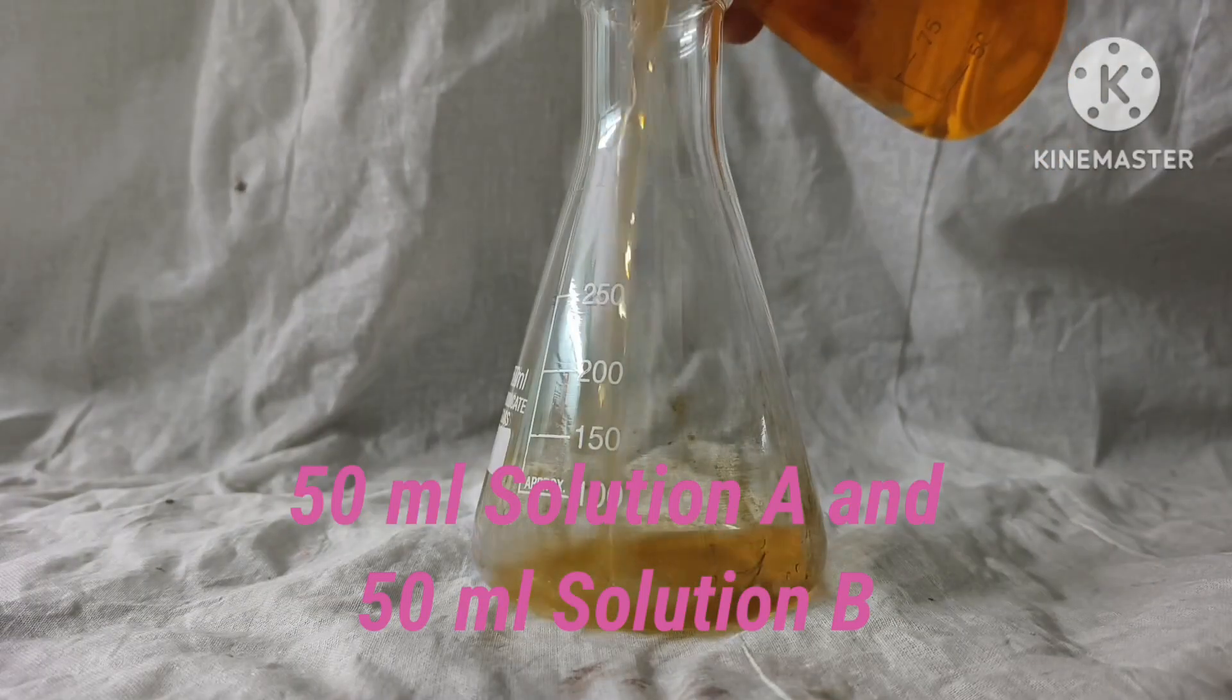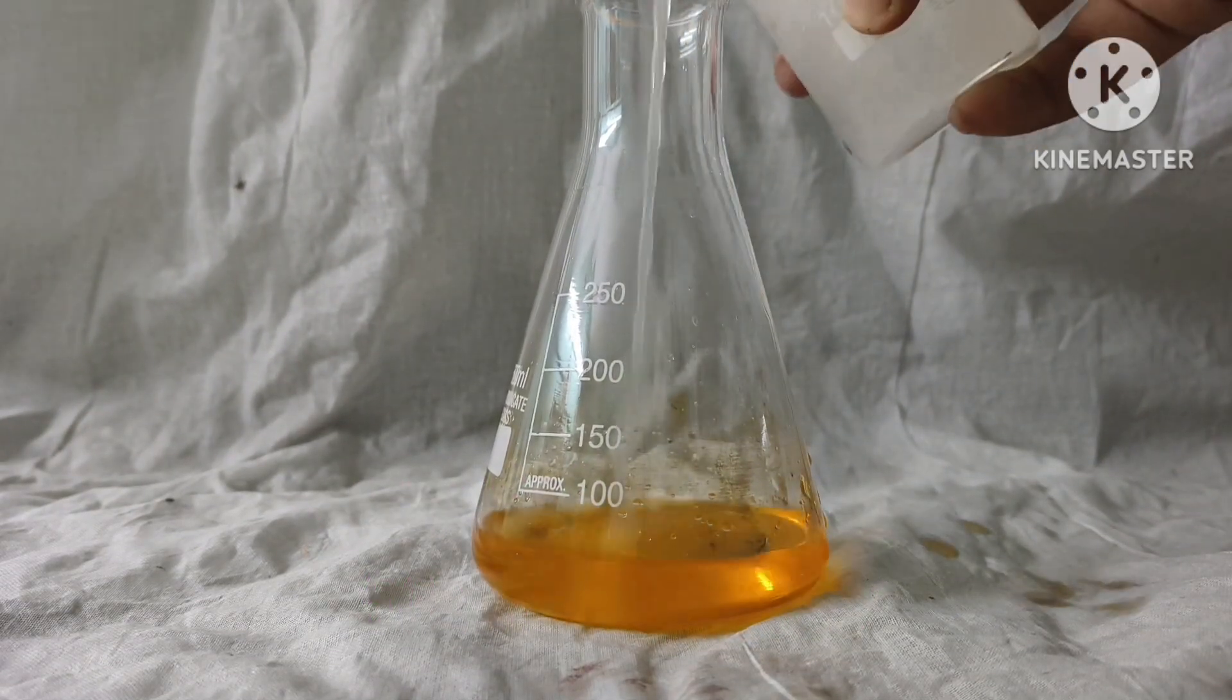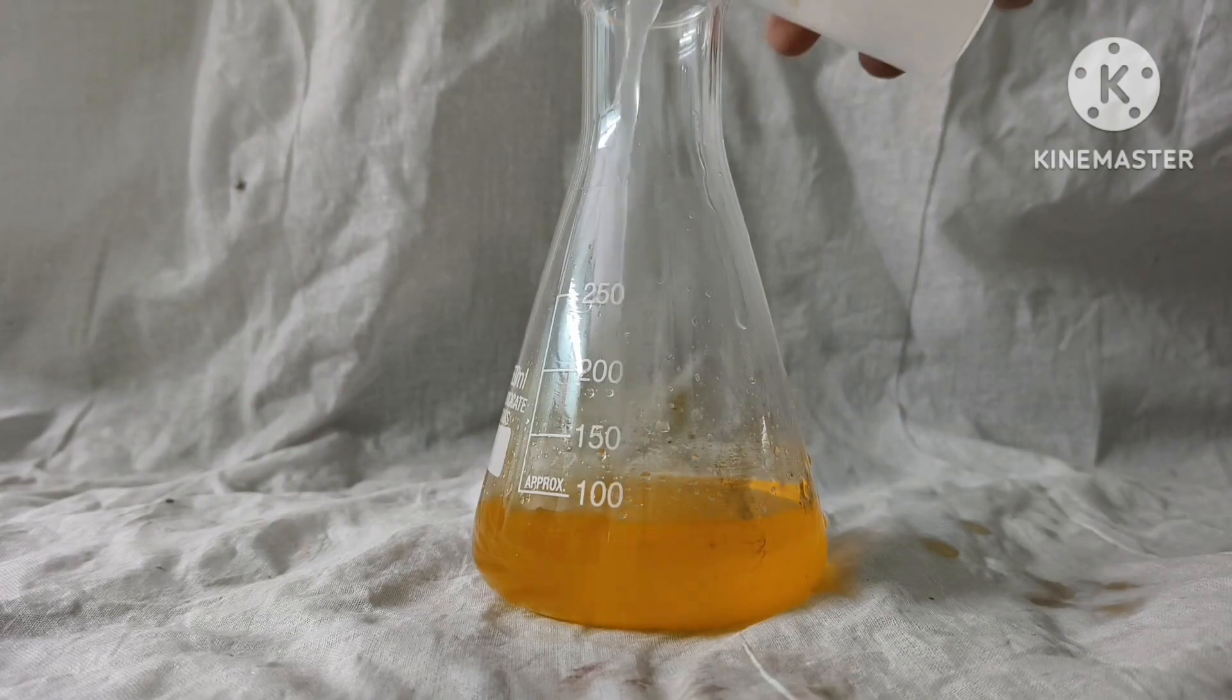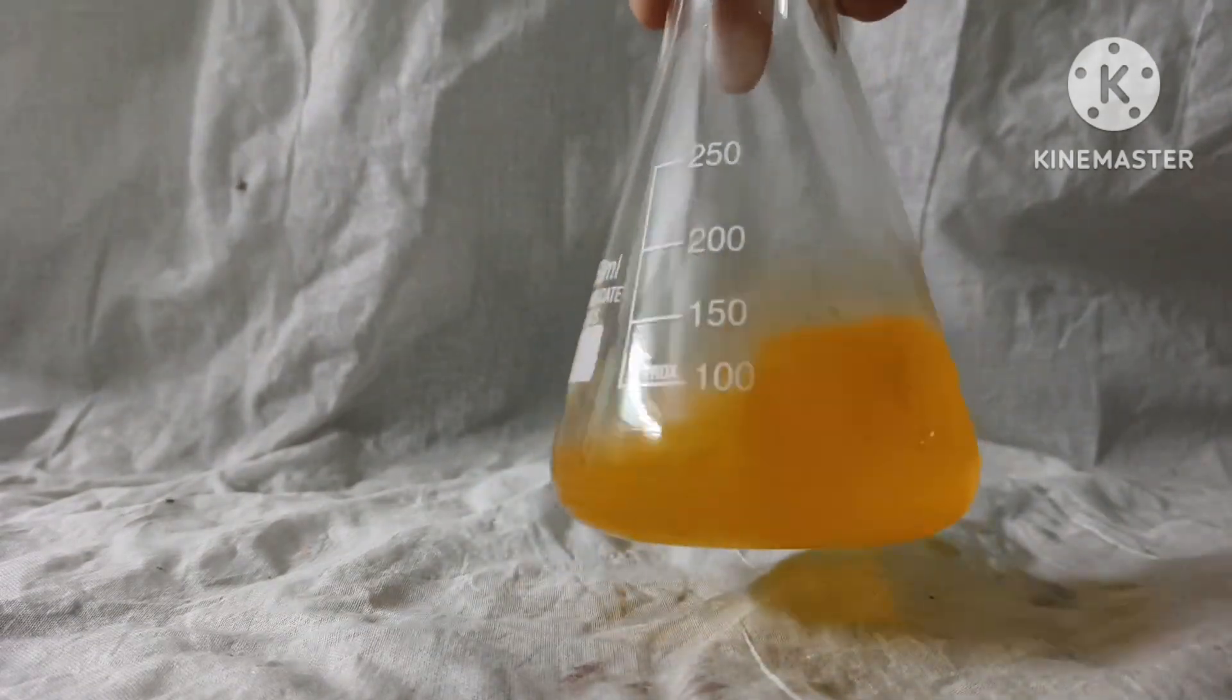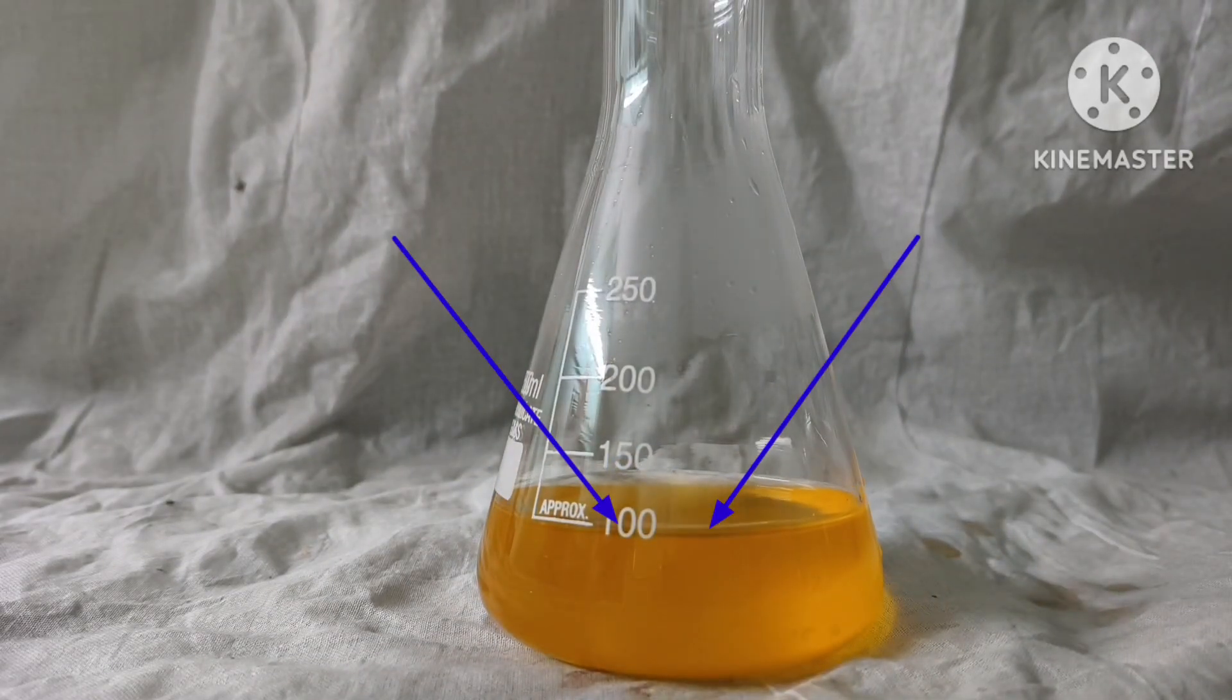I am mixing 50 ml of solution A and 50 ml of solution B in a bigger conical flask. Let the solution stand for a minute and just concentrate on the color of the solution and wait. The color will come.